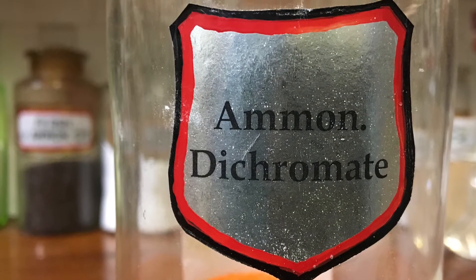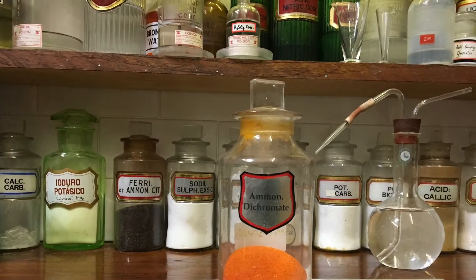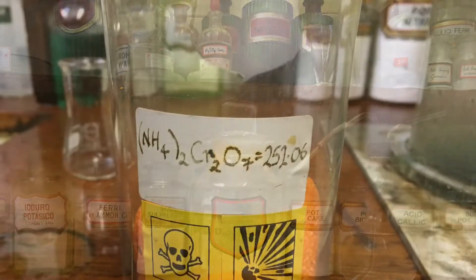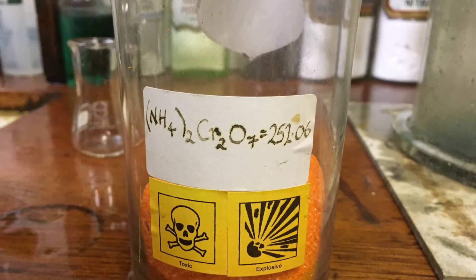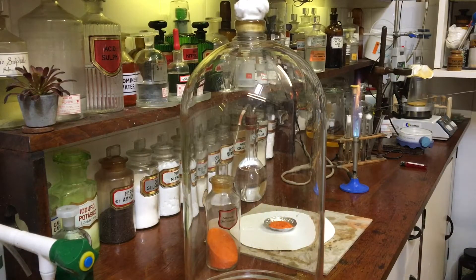Welcome once again to my laboratory. We're going to be looking today at some ammonium dichromate, one of my favorite chemicals, and I'm sure it's one of yours. Now ammonium dichromate has a beautiful orange color to it, but as you can see it's highly toxic, and therefore without a fume cupboard I'm just going to do this thermal decomposition in a large bell jar to contain the chromium oxide we're going to produce.